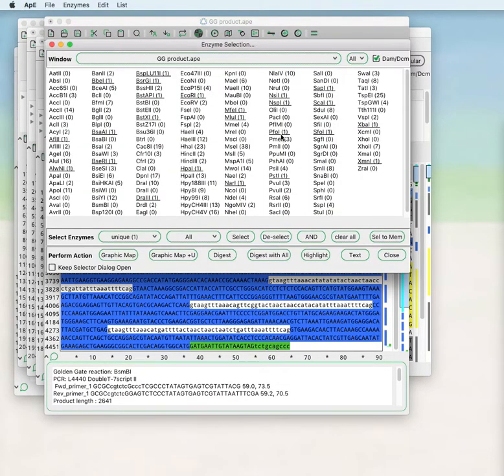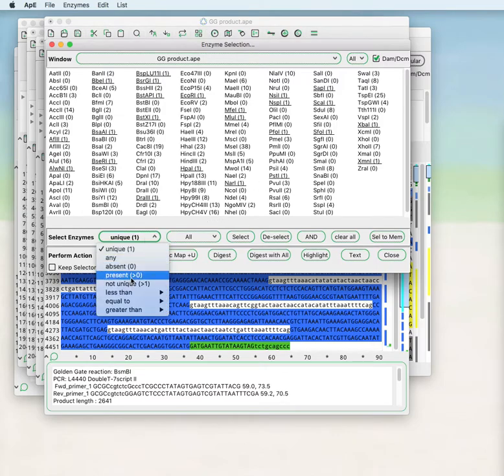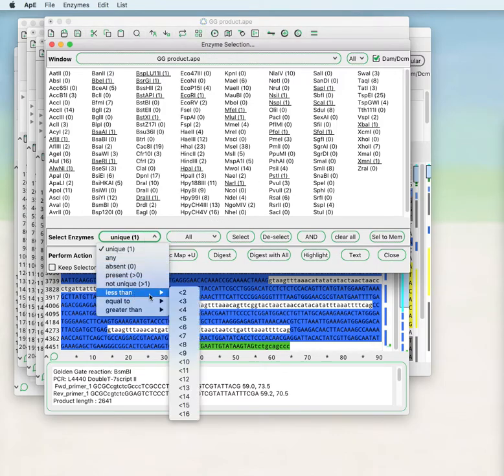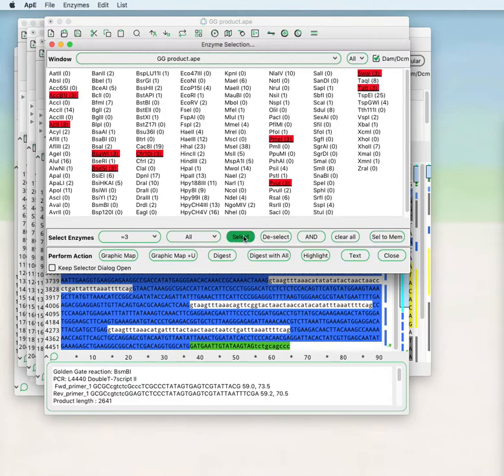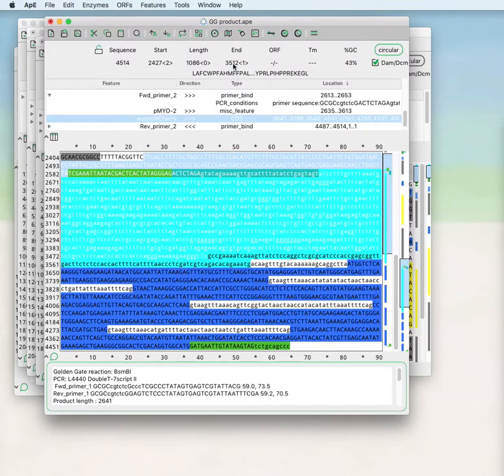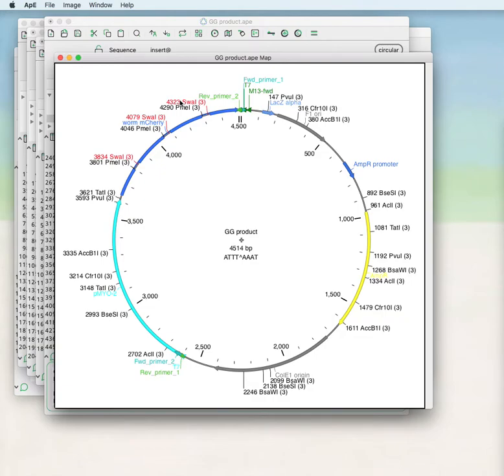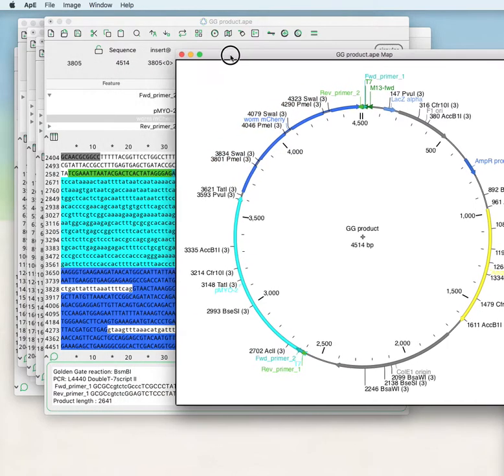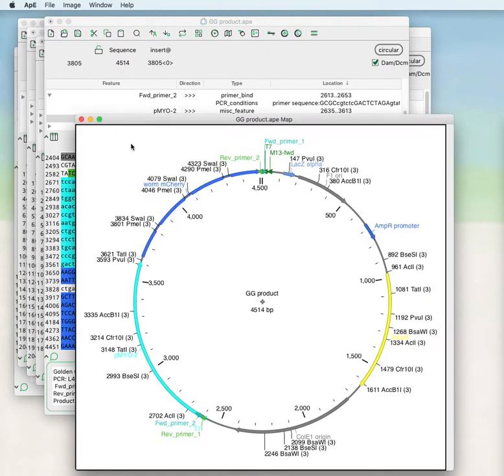If you have enzymes selected within the enzyme selection box and you do a graphic map, those enzymes will show up. If you put your mouse over the enzyme it will highlight all of the enzymes of the same type in red, and if you click on any of those enzymes it will change the selection to that site.